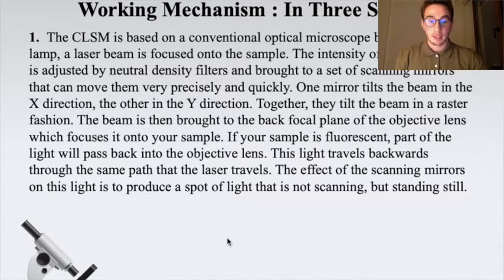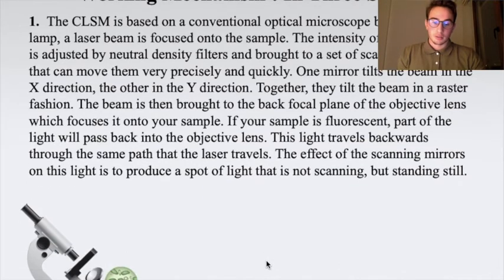We get the intensity of light and reproduce an image by detecting the light with photomultiplier tubes. I have to give some more detailed information about the XY axis movements.